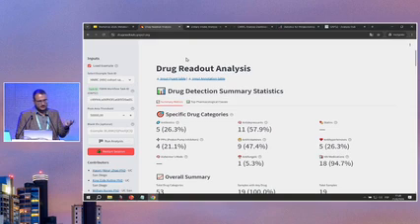You just need to have high resolution MS2 data, and then you need to convert that to mzML. Then you create an MGF file of that spectra, which you can get from an MZmine workflow that you run on your samples. Basically, that's the output you're going to get. Of course, you can use other software, but this is just an idea, as MZmine is one of the most popular ones.